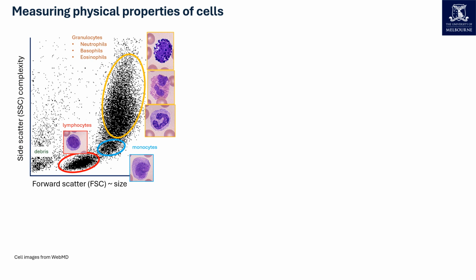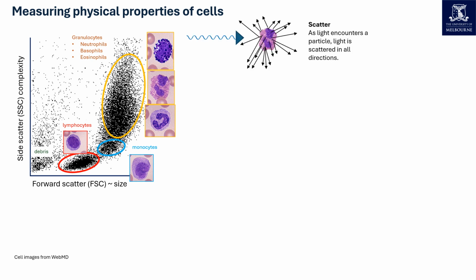As alluded to earlier and simplified for this presentation, cytometers measure physical characteristics of particles, revealing their relative size and complexity. These measurements are captured based on the amount of light that is scattered as particles cross the blue or violet lasers. As cells cross a laser, light is scattered in all directions.